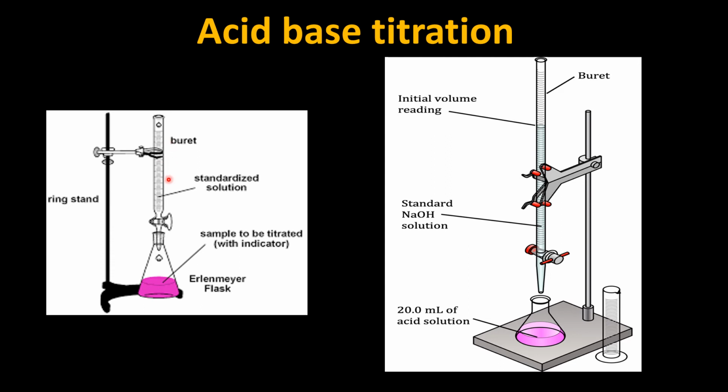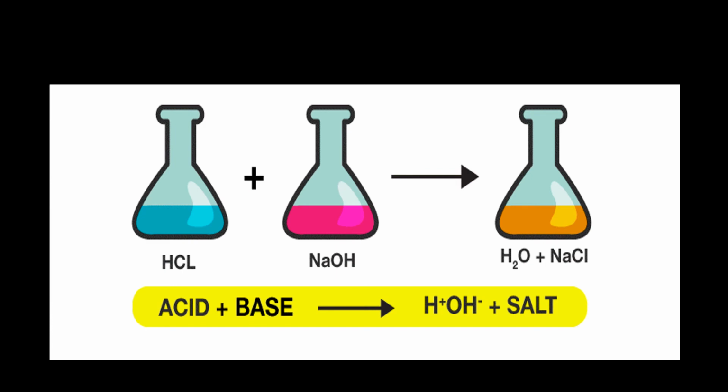This is the chemical equation which is used for this process. I have used HCl and sodium hydroxide, a very famous reaction, a neutralization reaction, and I will get sodium chloride with water. Now why have I written this equation over here? I have written it to find out the number of moles. I need the number of moles in my calculations, so that's why I have to mention the chemical equation as well.